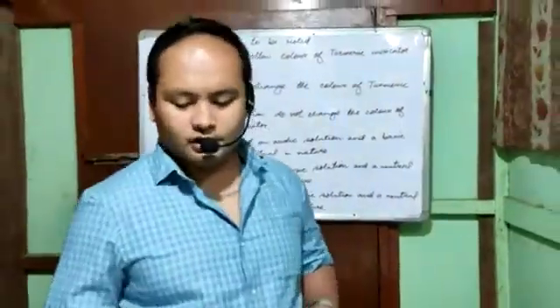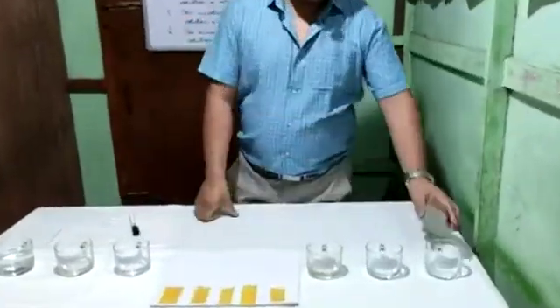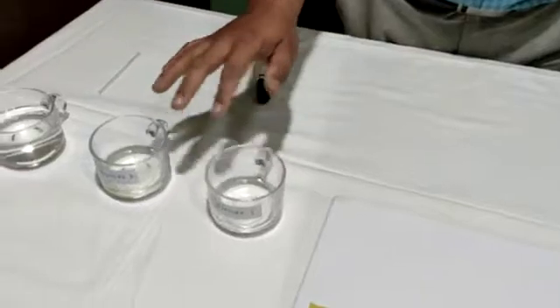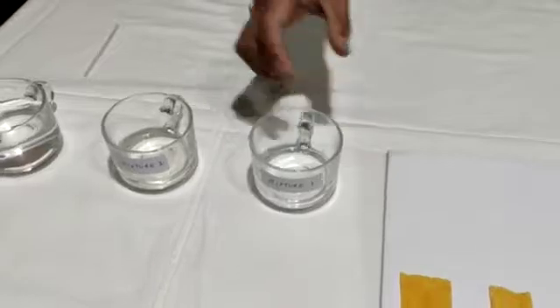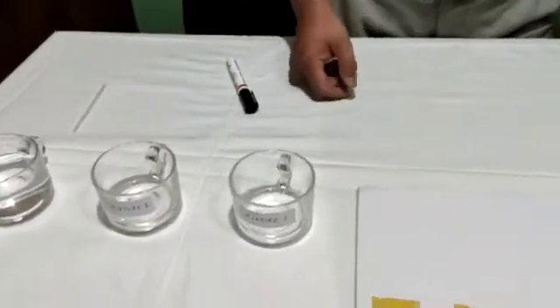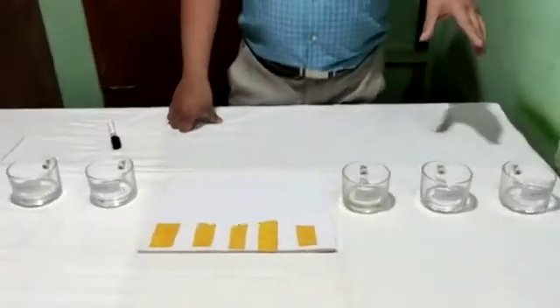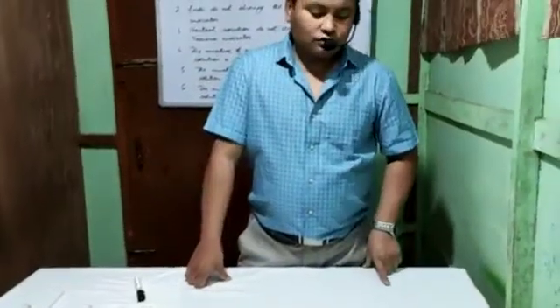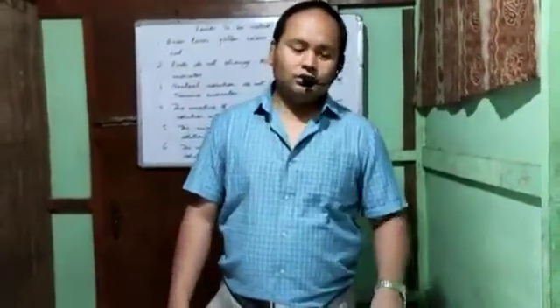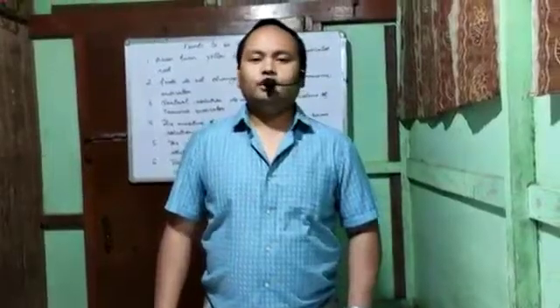Now let's come to our activity. Before we actually start, I'd like to introduce what these things are. So this is liquid 1, liquid 2, liquid 3, and this is mixture 1 beaker and mixture 2 beaker — these two will be made afterward. In fact, these three liquids are actually an acidic solution, a basic solution, and a neutral solution, but we don't know which one is which. We will find out which one is the acidic, which is the basic, and which is the neutral solution with the help of turmeric indicators.